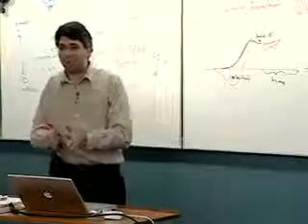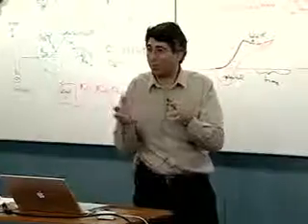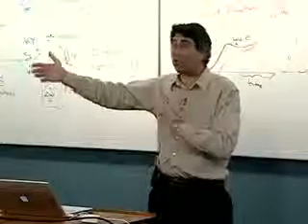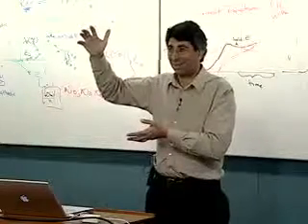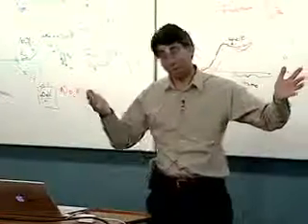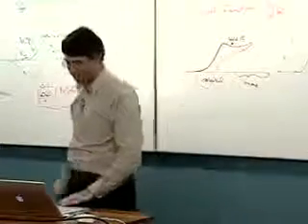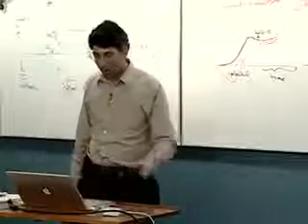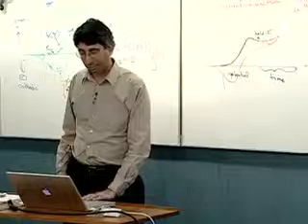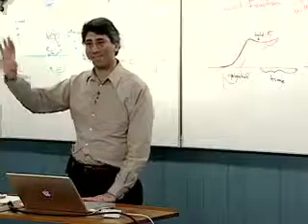Nonetheless, even if you were doing that, that's a big deal thing. You're not going to start off with, here's my brand new molecule, and I'm going to take a set of cyclic voltammograms, and then step 2 is going to be a digital simulation. You won't even know what to digitally simulate, right? You still are going to want to take a look at these cyclic voltammograms and the diagnostics and say, oh, it looks like an EC mechanism or what have you, or reversible, what it might be. You need to start there. So although you have a more powerful technique, it's not useful until you've done this, really. And of course, when you do that wonderful simulation, it will take into account the baseline differences, and you don't have to worry about that.